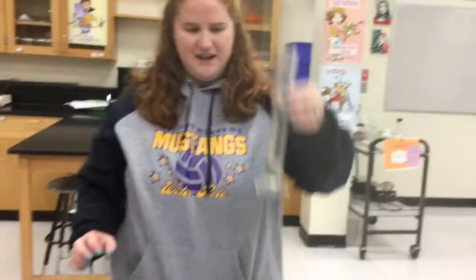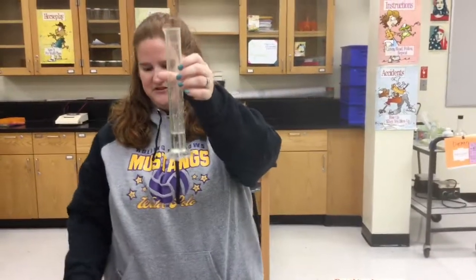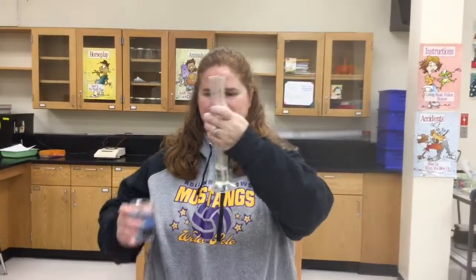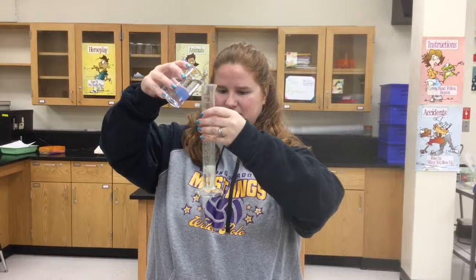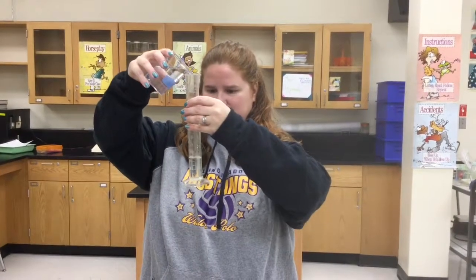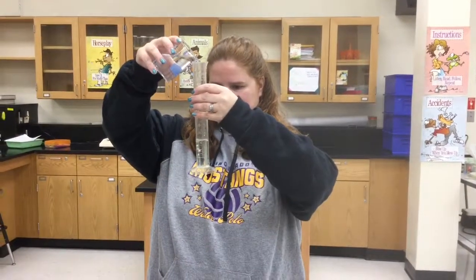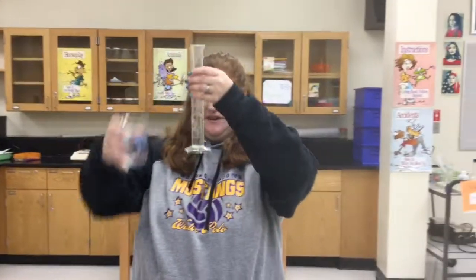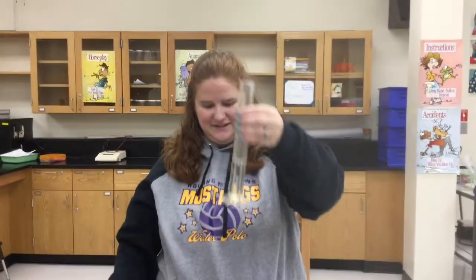All right, so now I can just continue to add a little bit more water since I'm starting small and going larger. Yep. So, I suppose that's okay. We know it's water. It's labeled. It's from the sink. You even may have gotten it yourself. Oh, look at this. I think I got it exactly on 40.